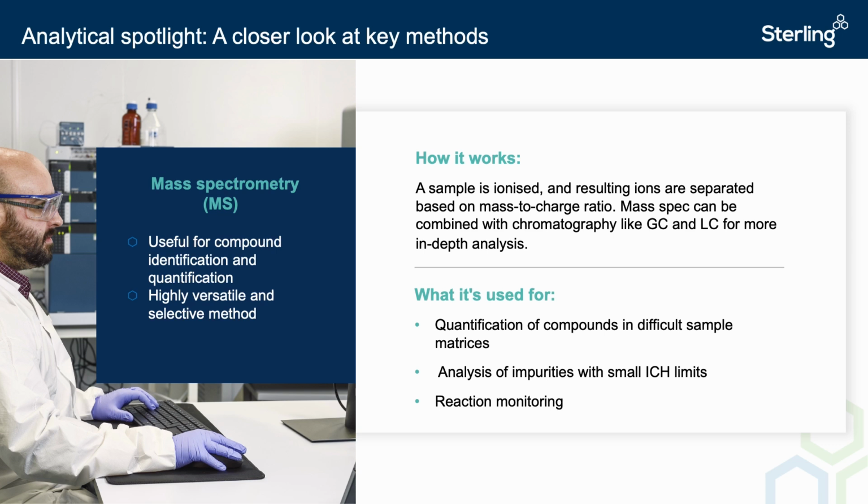It's also incredibly sensitive. It can be used to evaluate analytes that have a poor UV response or cannot be separated by traditional chromatographic methods, like with peptides and epimers. The slight difference in fragmentation patterns allows us to accurately quantify and identify different structures of the same mass.